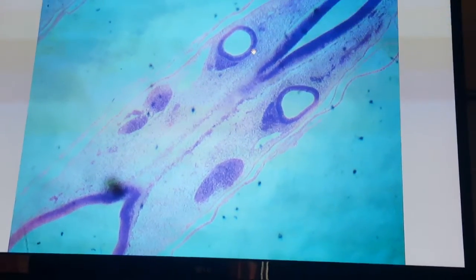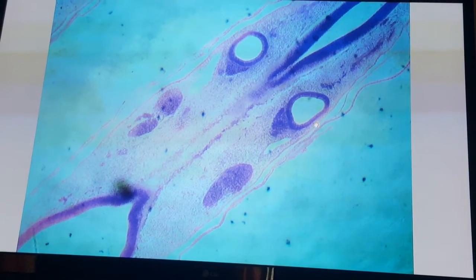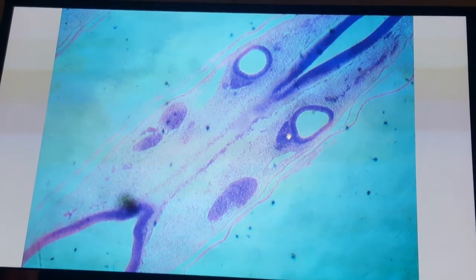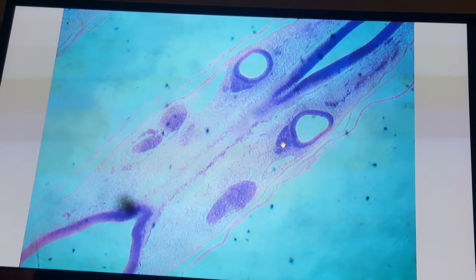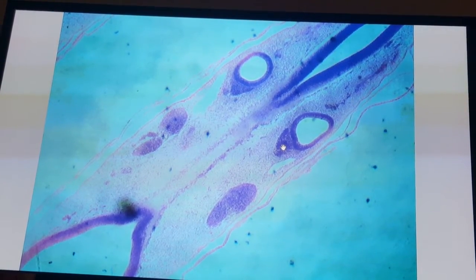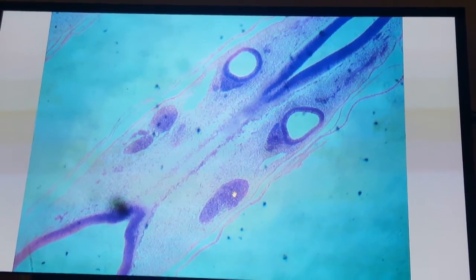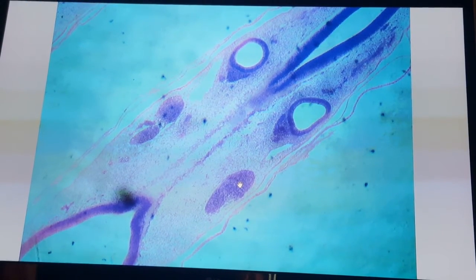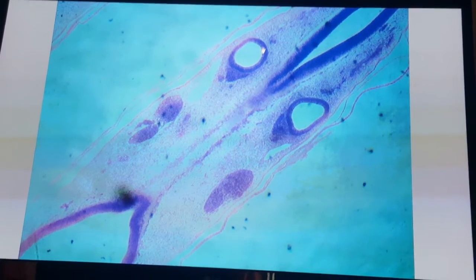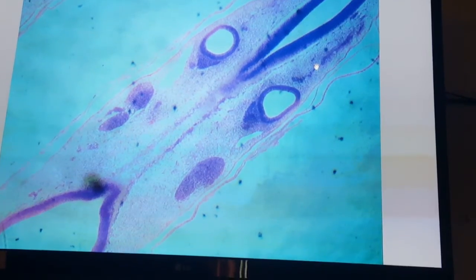The section also shows the primordium of the ear vesicle, which is called the otocyst, on that side and that side. And what is anterior to the ear vesicle, this is the ganglia of the 7th and 8th cranial nerve, which is therefore called the acousticofacialis ganglia. And more anterior, this is the ganglia of the trigeminal nerve, which is the 5th cranial nerve. While behind the ear vesicle, this is the ganglia of the 9th cranial nerve and ganglia of the 10th cranial nerve.